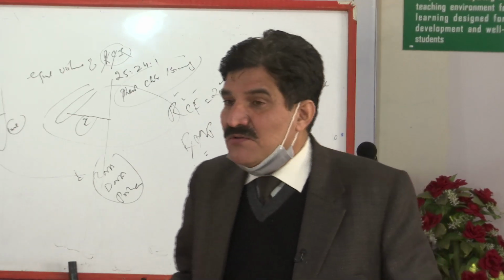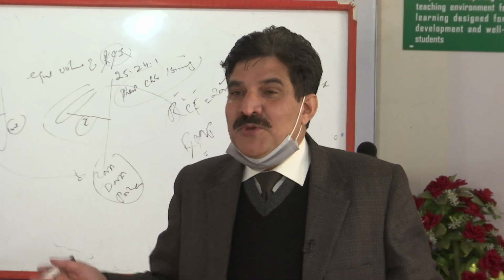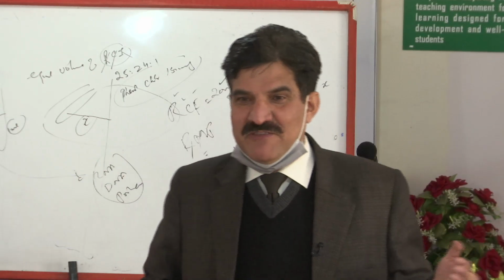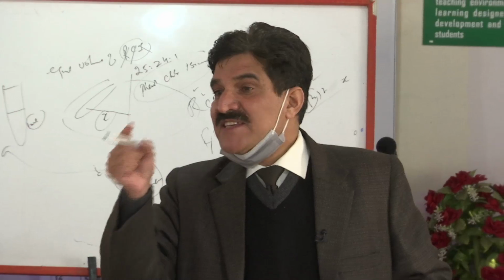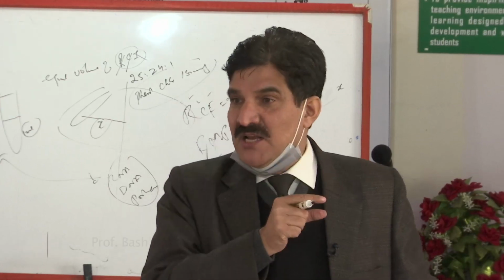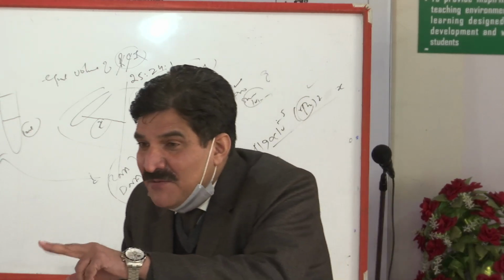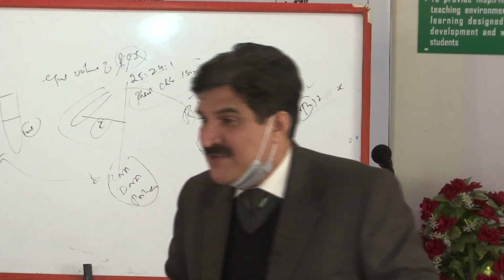What is the role of phenol? Anyone? No. Phenol is called carbolic acid. Have you heard about it? Yes. It contains an OH group which is acidic. Chemistry people must know very well because of the conjugation system. So it is carbolic acid, but we are saturating it with buffer. It should not be plain phenol, it should be saturated phenol. Keep it in mind, because when it is acidic in nature, it will disrupt the pH of the solution and will not distinguish between RNA and DNA.